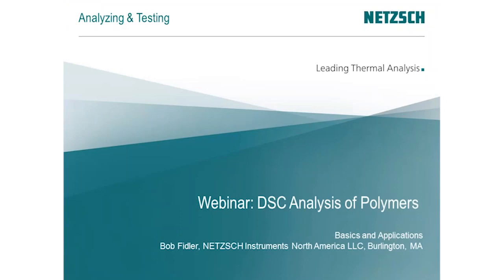Today's webinar is going to feature the basic DSC analysis of polymers. We're going to look at things like operating principles of the DSC, the method itself, go into a bit of the theory and the mechanics of the method, and then we'll follow that up with applications for quality control and also failure analysis, and then we'll summarize and talk about some other things that are available for educational purposes from the company. So thanks again for being here, and it's really exciting and a great day to have you for the webinar.